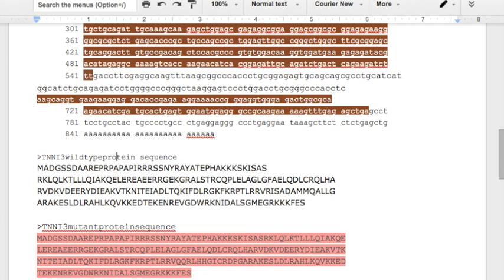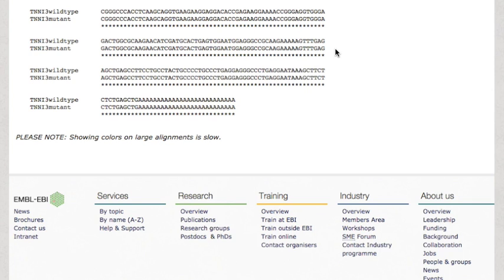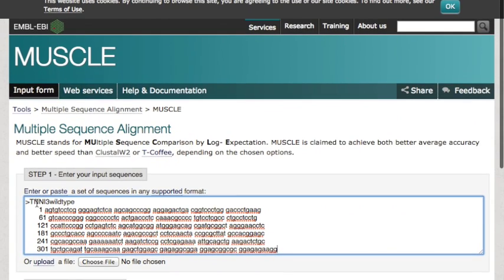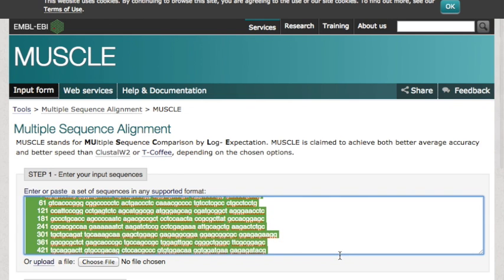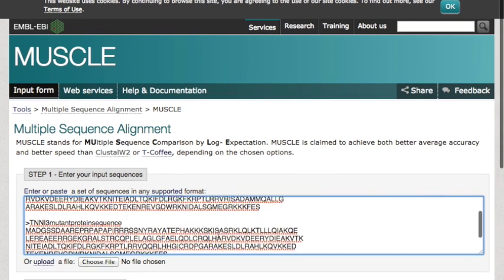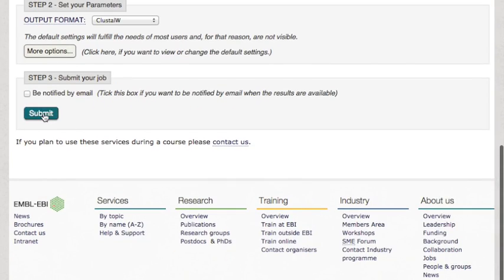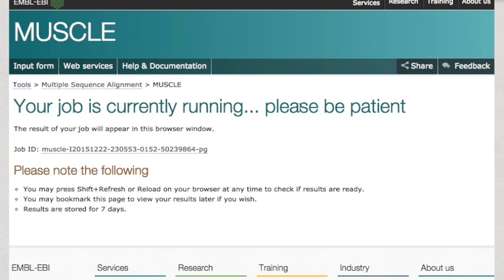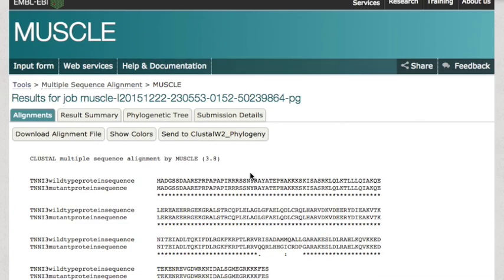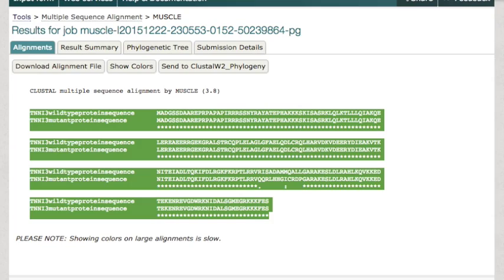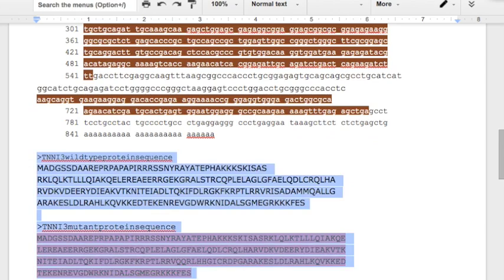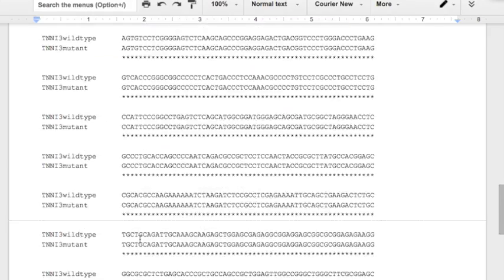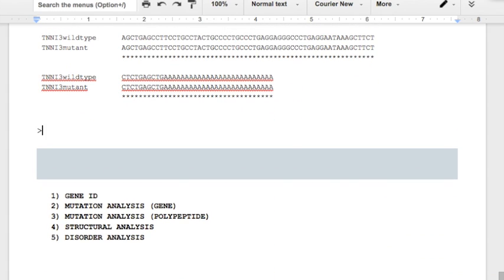So taking these, again, the names are fine as long as you precede them with a greater than sign. Copy. We're going to put them into muscle, our multiple alignment sequence tool. Paste those in. Two different protein sequences. Hit submit. And in just a moment, we will see a protein alignment, and we should be able to identify what the mutation's effect was. So here we go. Here's our protein alignment. I copy that. I'll paste this in as the protein alignment.